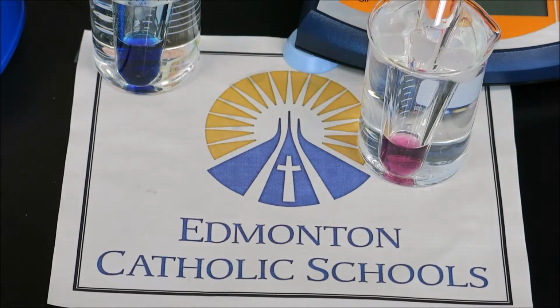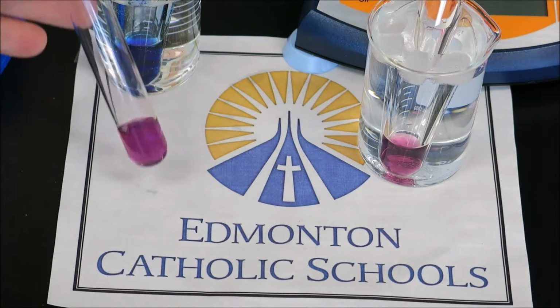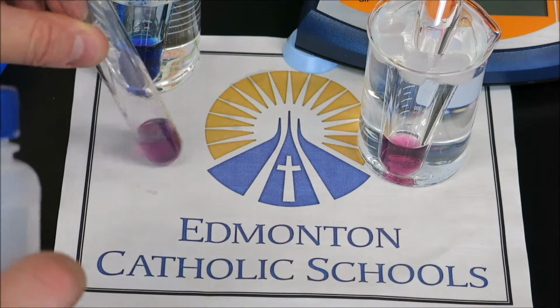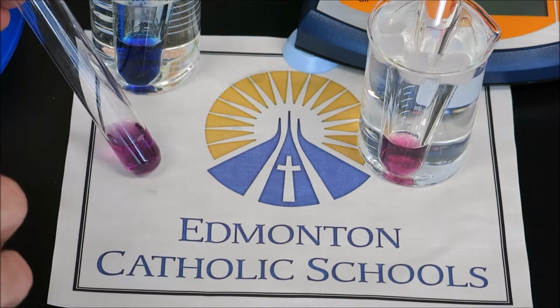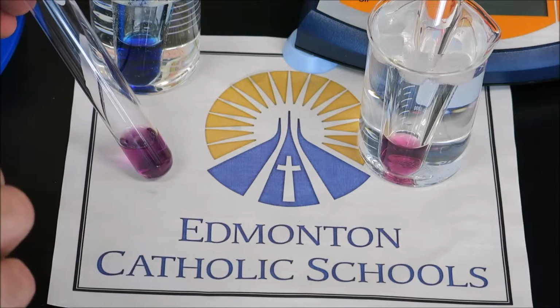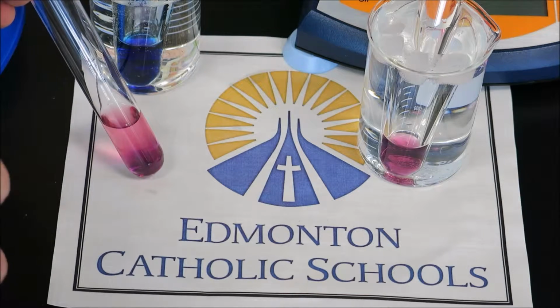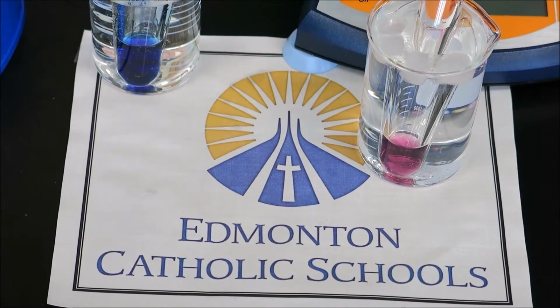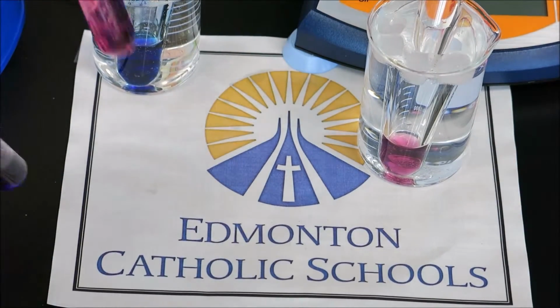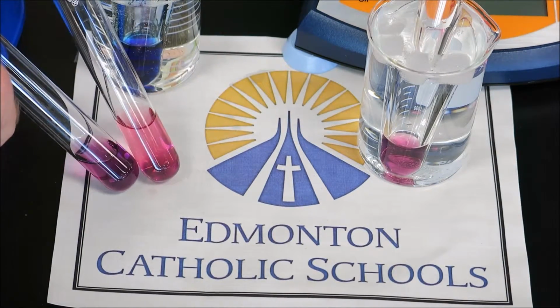Our third test is going to be adding something to the system. So we start again with our controlled state here, our equilibrium state, and we are going to add water as a reactant. Now, water here is going to be added at room temperature so that temperature is not also a factor. So only one manipulated variable. And let's observe the change as I add distilled water to the system. We can see that the color did not dilute and become a lighter purple, but the color did in fact become pink. And we can compare that to our control, and we can see that adding water did in fact turn the solution pink.